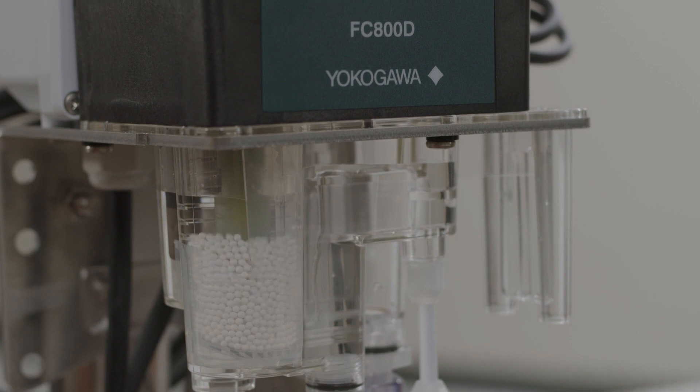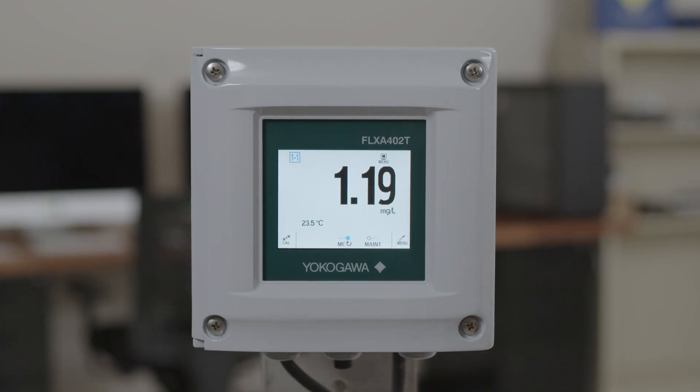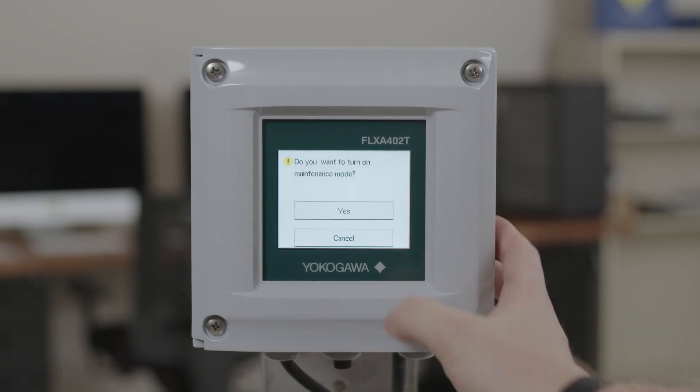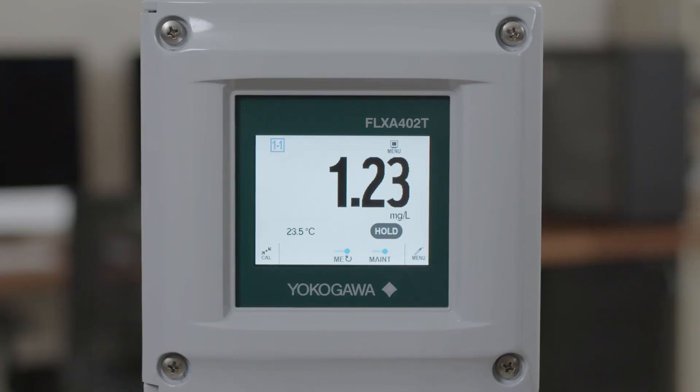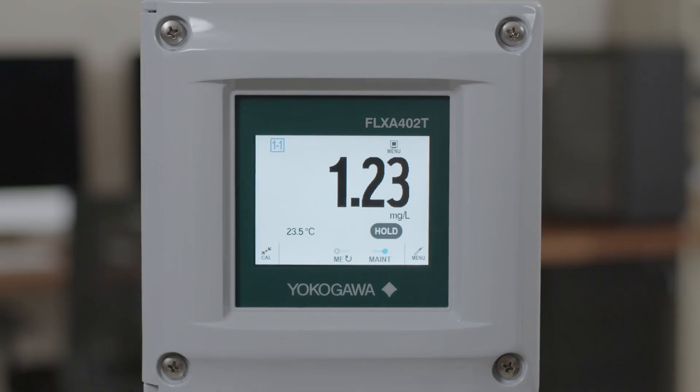For cleaning the flow cell, the first thing we will do is put the analyzer into maintenance mode. You can do this by pressing the maintenance button on the home screen, clicking yes, and then also turning off the measurement electrode. You have a measurement electrode button on the home screen — press this button, hit yes, and the motor will stop.